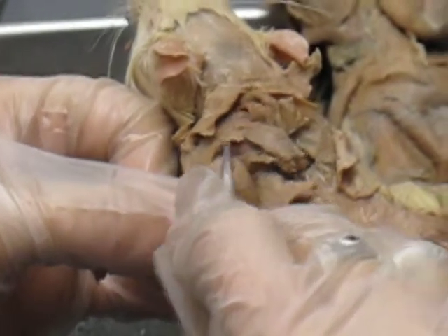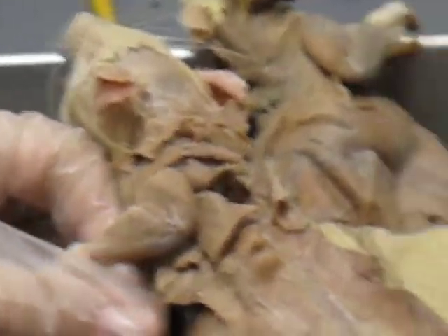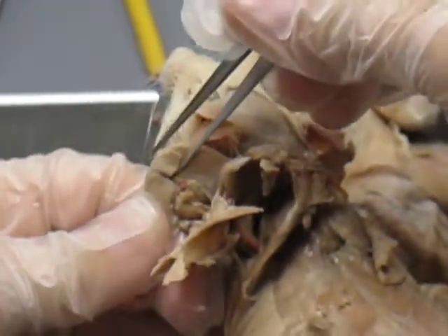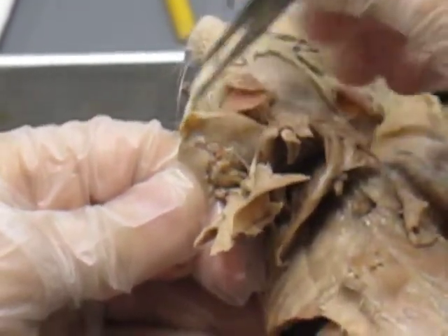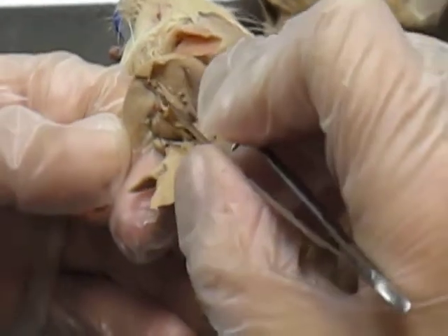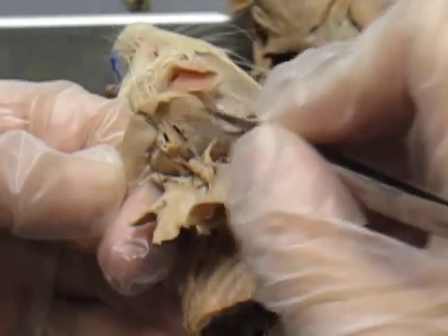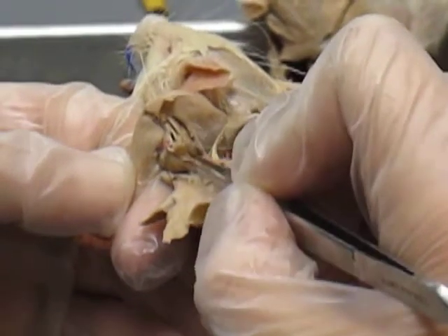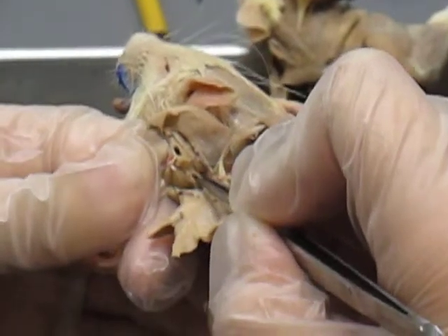And underneath your spinodeltoid is your infraspinatus. Then when you do your reflection of your arm, you lift up your tensor fascia antibrachii, which typically runs all the way across. You can see that it starts to be divided into some sections — the top one, the thickest region, is your triceps brachii longhead. Directly below that is your triceps brachii medialhead. And below that, which runs along here and here, is your coracobrachialis.